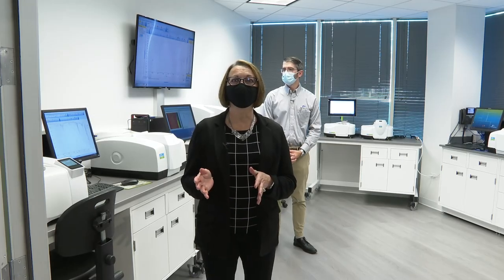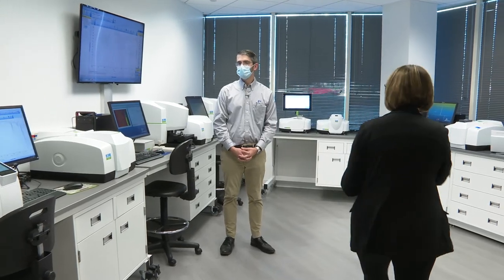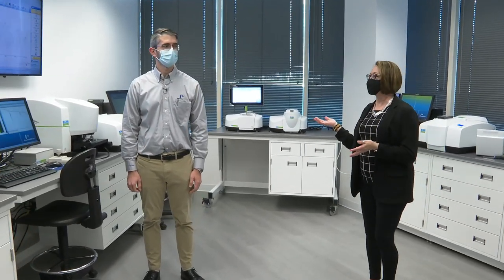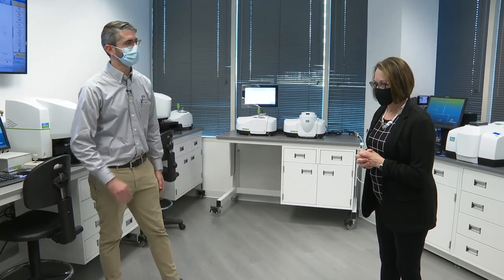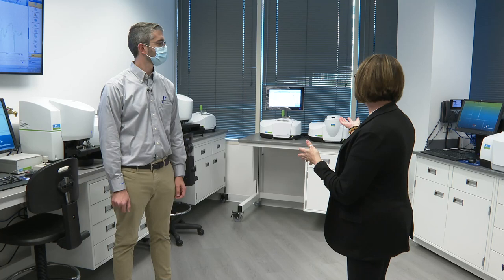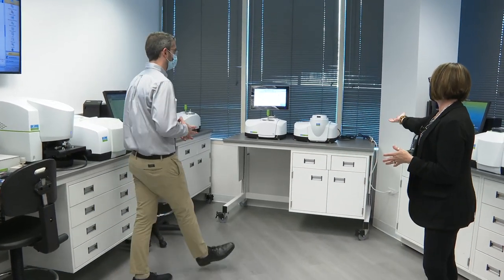So next we're going to go into the FTIR lab and I'd like to introduce you to Ryan. He's another one of our scientists here at the Downers Grove Tech Center. Can you give us a quick overview of the various instruments in here, maybe starting with these instruments right here?